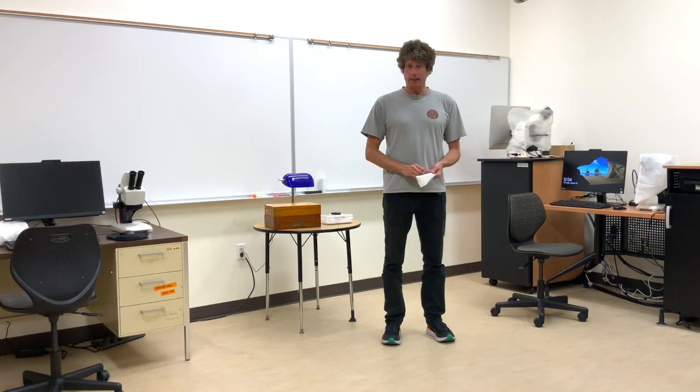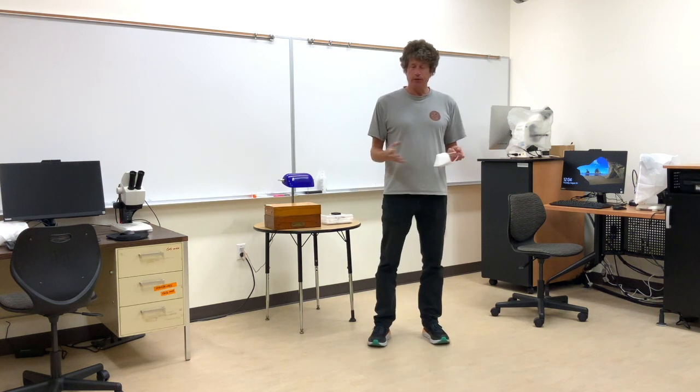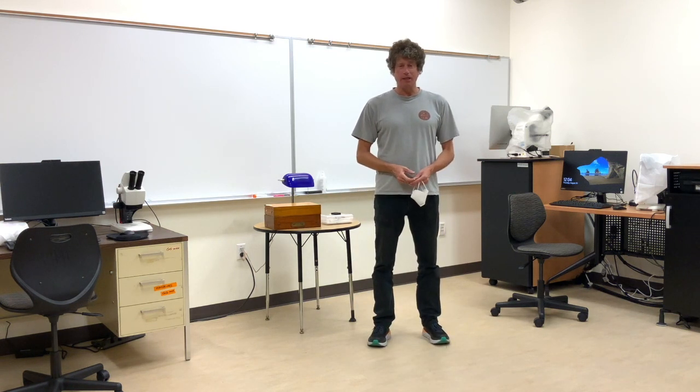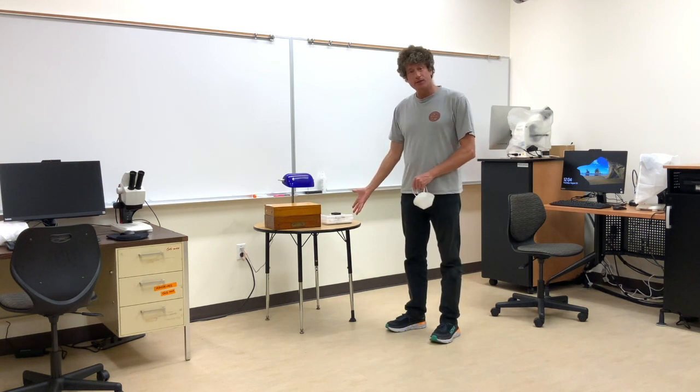We've got two Leica dissection scopes — one there and one there. They're fairly user-friendly to use so you shouldn't have any problem, and you're also going to use the LASX software from Leica. And then we've got some insects right here that you can use.